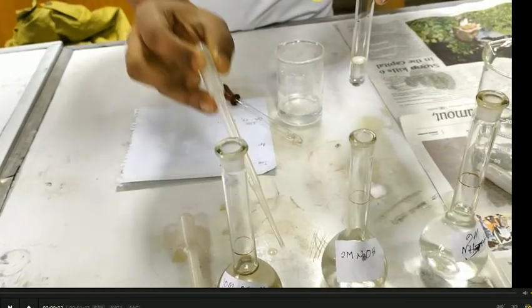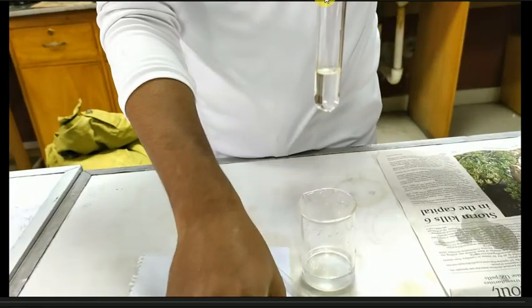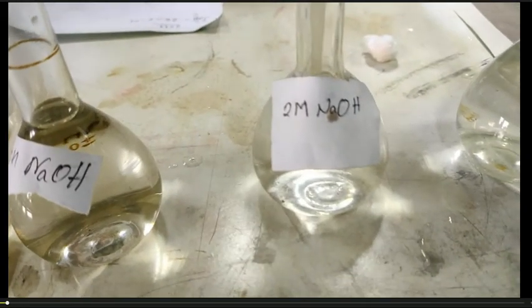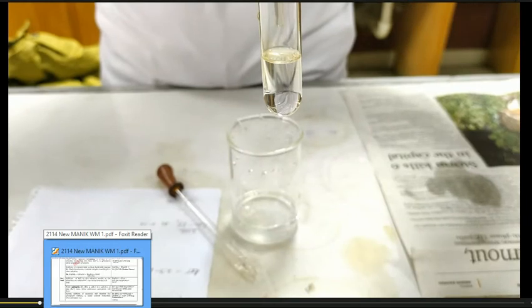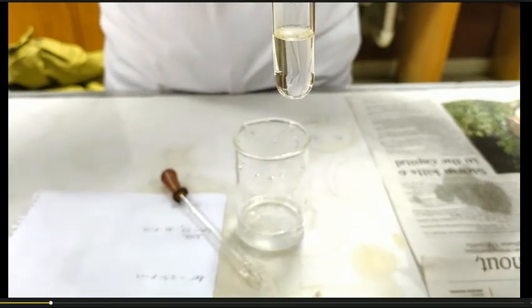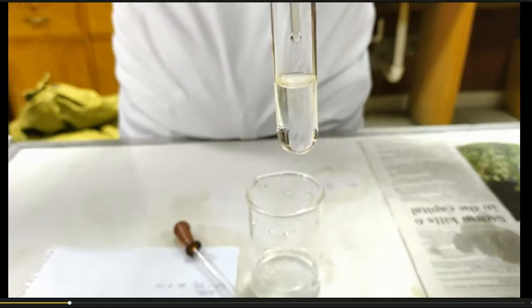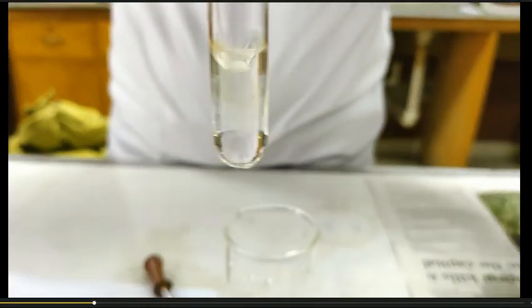We are going to test for the presence of zinc ion. In this case, we have taken 2 ml sample solution and we are going to add dilute, that means 2M, sodium hydroxide solution into this solution. This will produce a white PPT, and the PPT appears. This is the presence of white PPT.